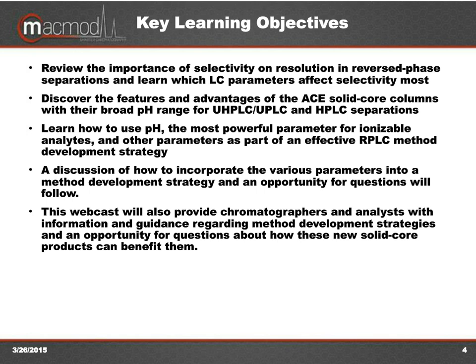Next, we'll look at how to use mobile phase pH and other parameters as part of an effective reverse phase method development strategy. We'll examine some different strategies for method development ranging from relatively simple to very complex for more difficult samples. And toward the end of the presentation, we will review some data that I generated in preparation for a presentation given at PittCon 2015 earlier in March.